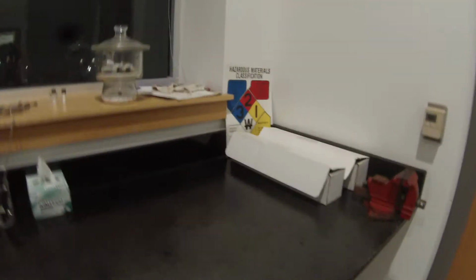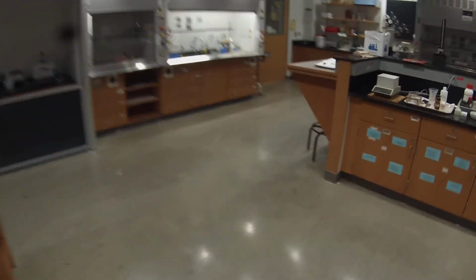Some of these esters are pretty volatile, so I'm going to store it in the freezer so we don't lose any to evaporation. That's why I parafilmed it. So that's it for now for the unknown alcohol.